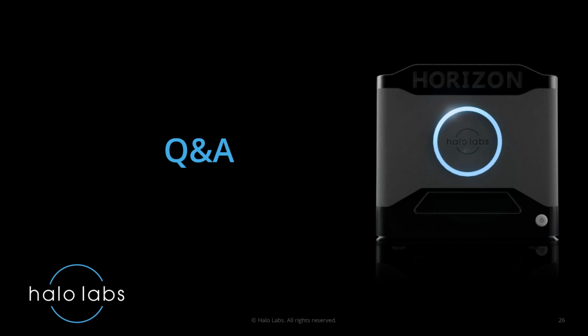Perfect. Thank you, Gabriel. And so our next question, what are the material and time expenditures for the BMI technique? The BMI technique is, once you have your instrument in place, there's only one consumable that you need, and this is the plate. The plate is basically a filter, you saw it, where you apply your samples. You use one well per sample, and then this you can pass to the manifold where you do the aspiration and then take into the instrument, and that's all you need.